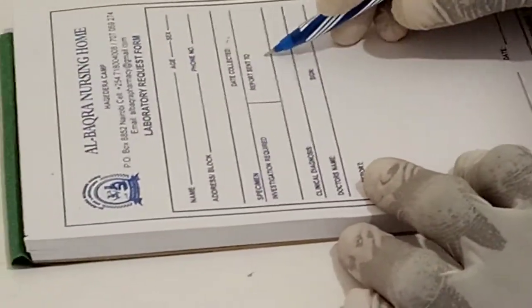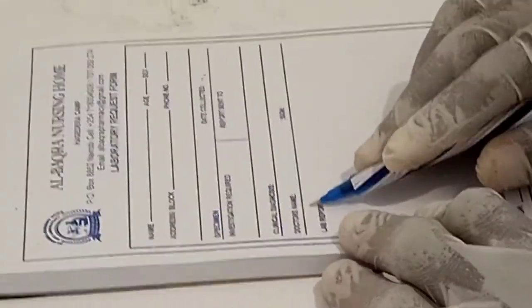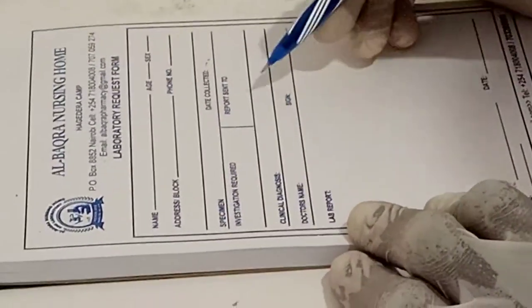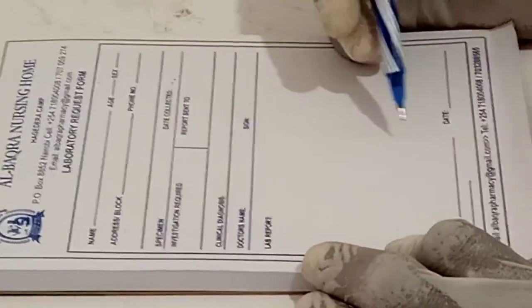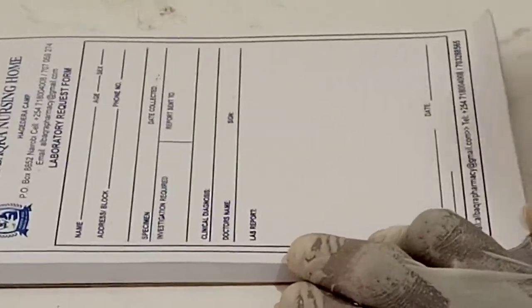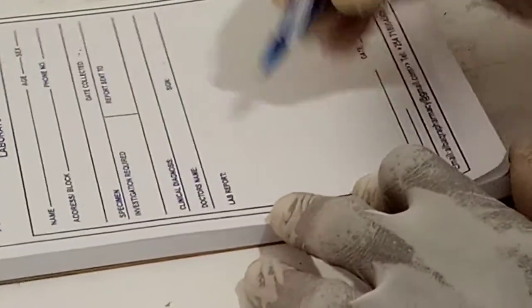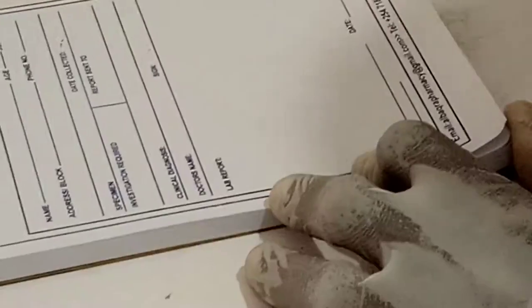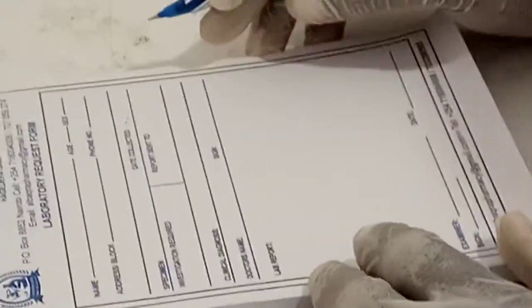Here is the report to send, the clinical diagnosis. So here is the doctor's name. Also here is the signature of the doctor. This part, the person who is in the laboratory must write the details here. So now let us start.